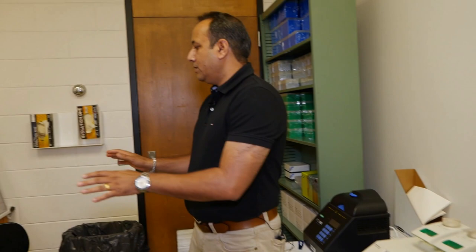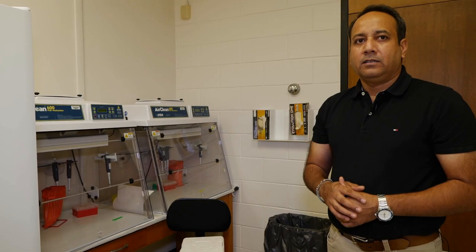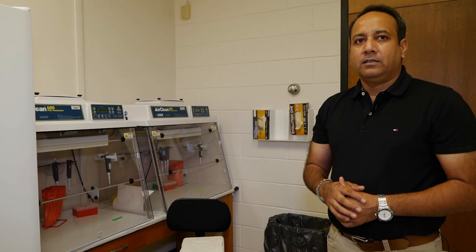These two workstations are our clean workstations. We use them to mix our reagents. One is for making the master mix and the second one is adding the DNA template that we isolated from the plants, from the leaves of the plants, plant tissue.